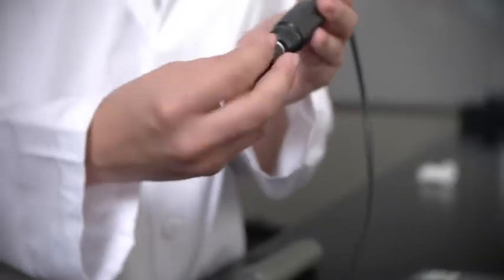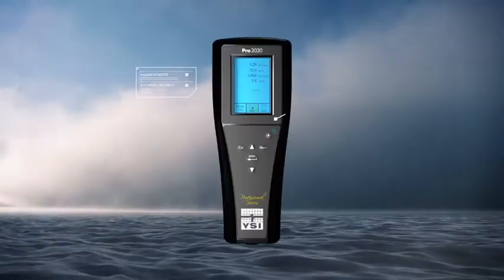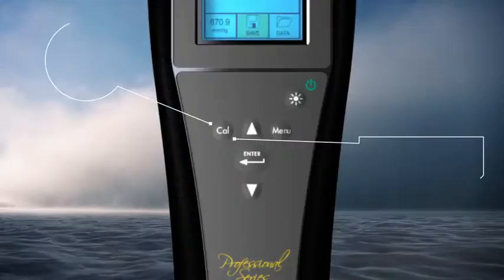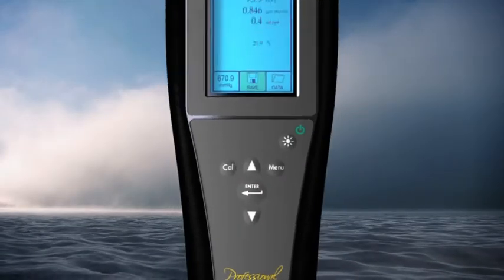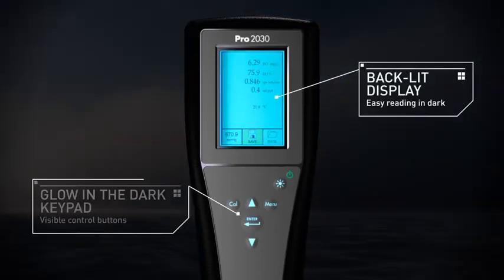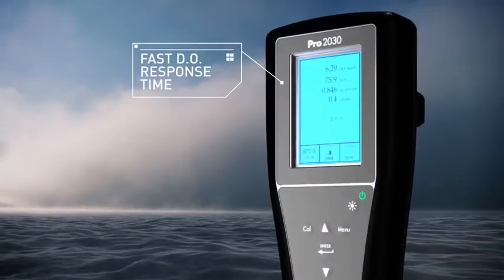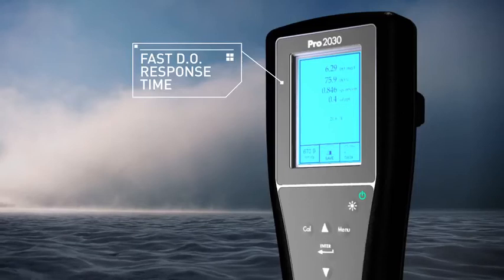The PRO 2030 includes these features: your choice of field DO sensors — polarographic or galvanic. An internal barometer for the highest accuracy data. A quick-cal function that calibrates DO within seconds with the push of a button. An easy-to-read graphic, backlit display, and glow-in-the-dark keypad. The fastest DO response time on the market — 95% of their reading in a stunning 8 seconds with a standard membrane.